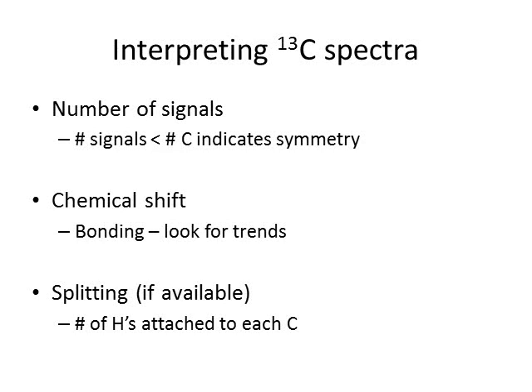So, for instance, a carbon that is 4 positions away from a chlorine will have a slightly different energy for the excitation-relaxation process than one that is 5 positions away from a chlorine. Because of this, different carbons will give different signals. And so if there's no symmetry in your molecule, there will be the same number of signals in the spectrum as the number of carbons in the formula.